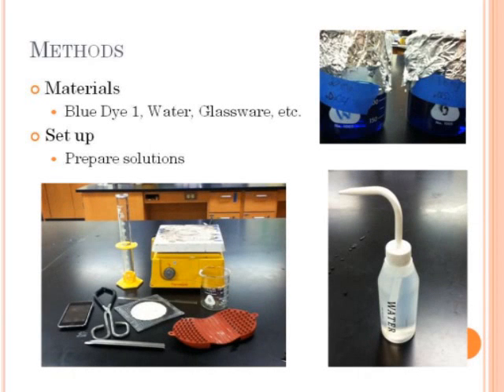For this experiment, we used 105 milligrams of FD&C blue dye 1, 700 milliliters of distilled water, one 100 milliliter graduated cylinder, 7 150 milliliter beakers, 1 large heating plate, 1 spatula, 1 glass stir rod, 1 Celsius thermometer, 1 scale, 1 pair of hot hands, 1 stopwatch, 3 pencils, and the necessary collected and tabulated data tables.